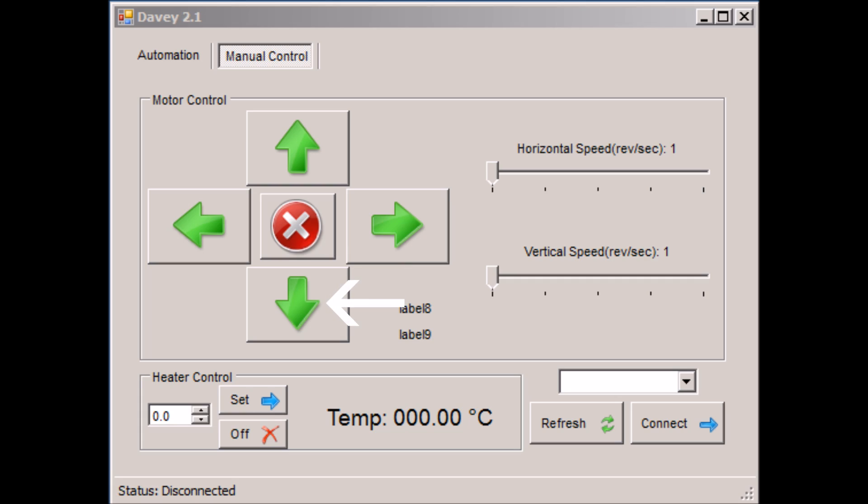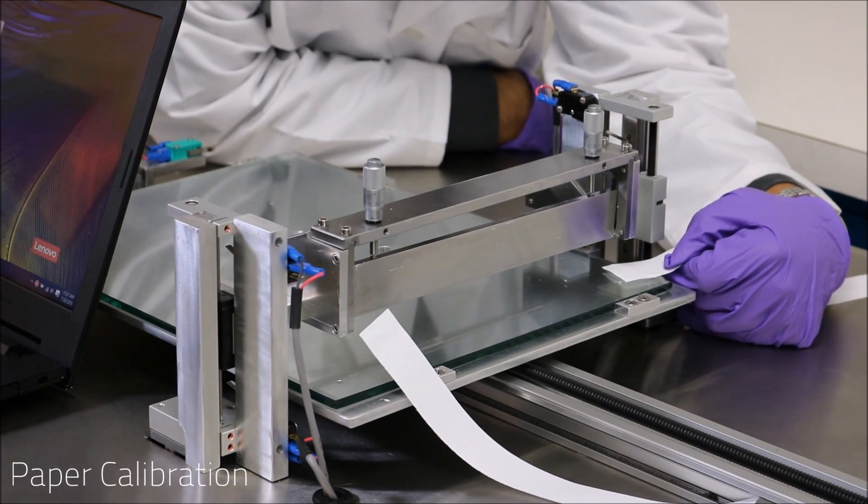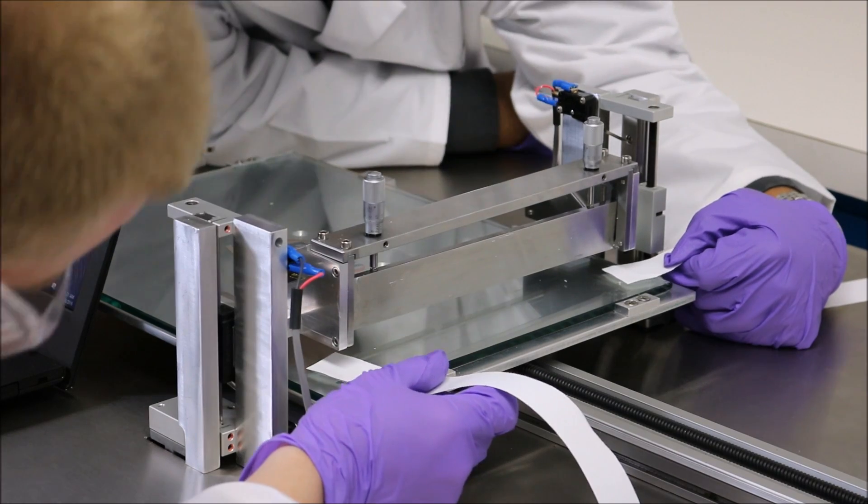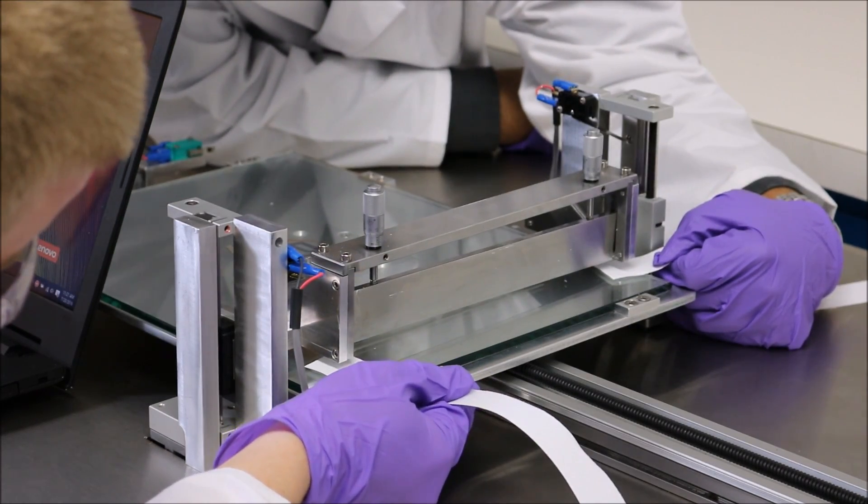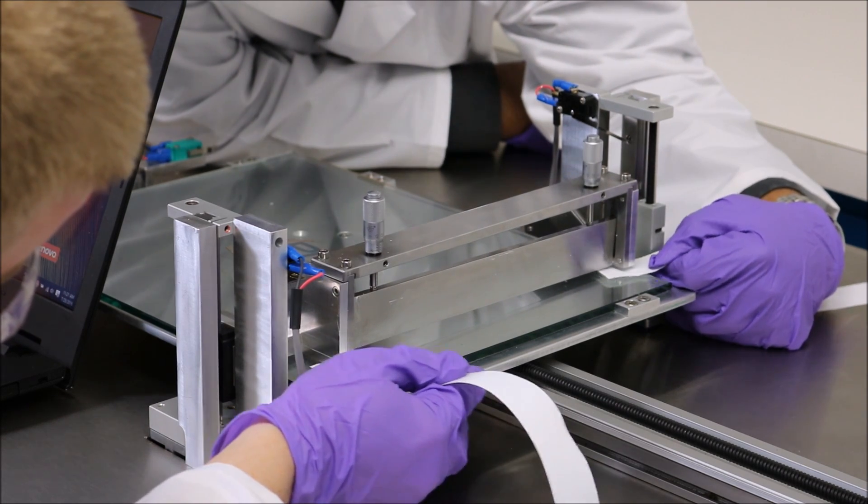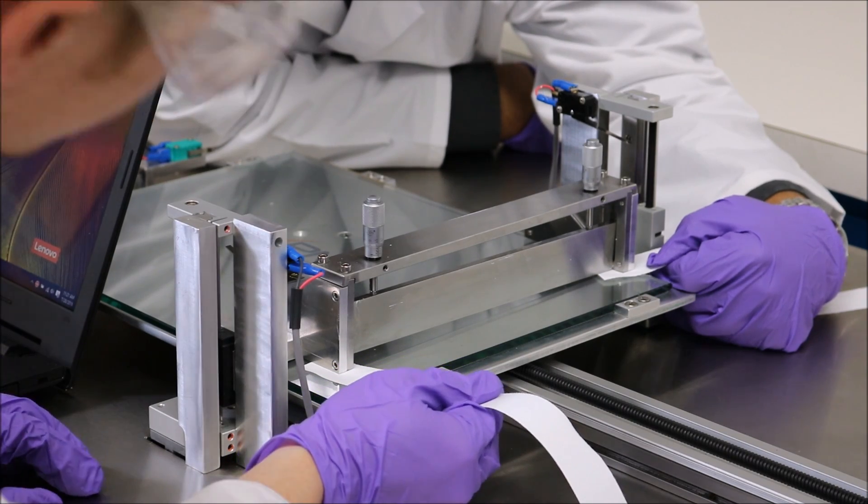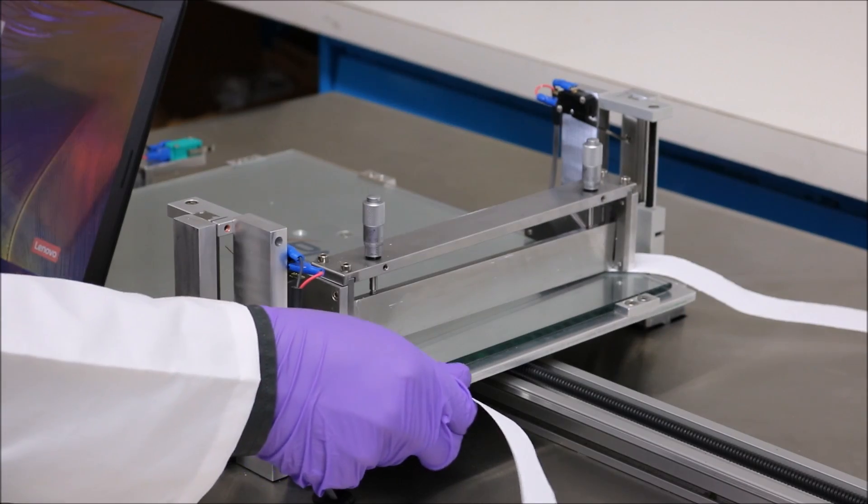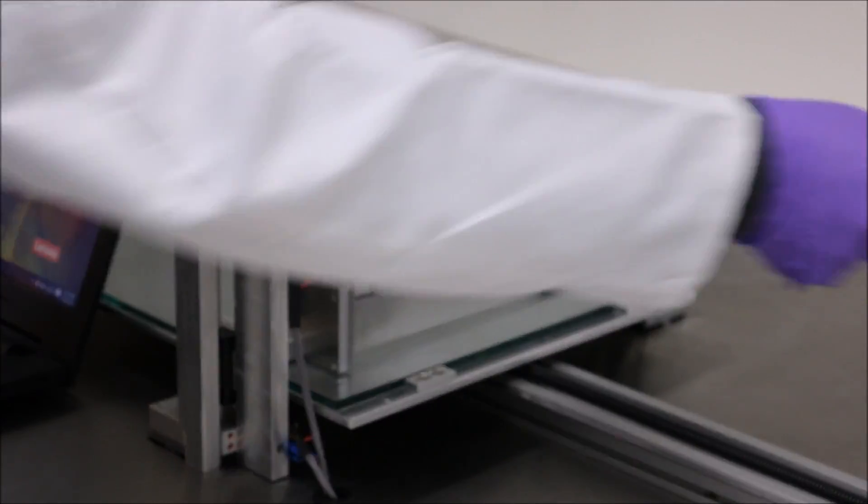At this point we will lower the doctor's blade down and calibrate our zero position with some A4 paper strips. The goal here is to lower down the doctor's blade so that the paper strips are difficult to pull out but not completely stuck. As you can see, there is some resistance while trying to pull it out, but as long as it does not tear, that is what we want.